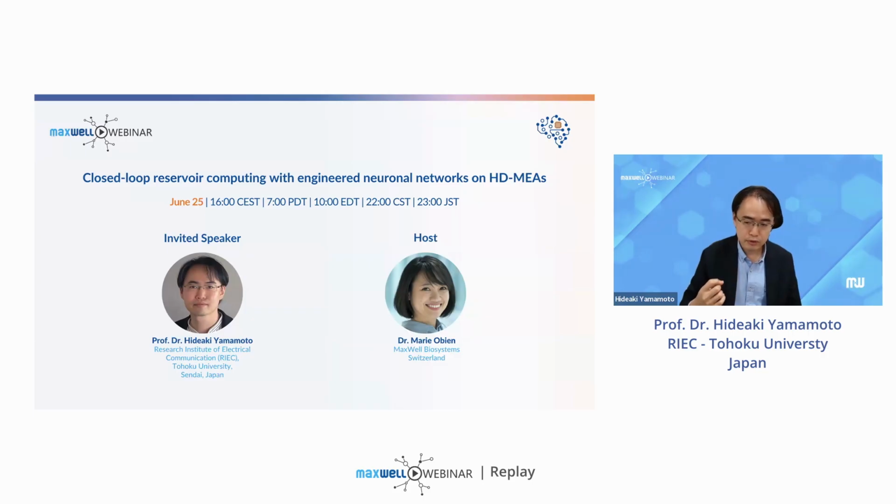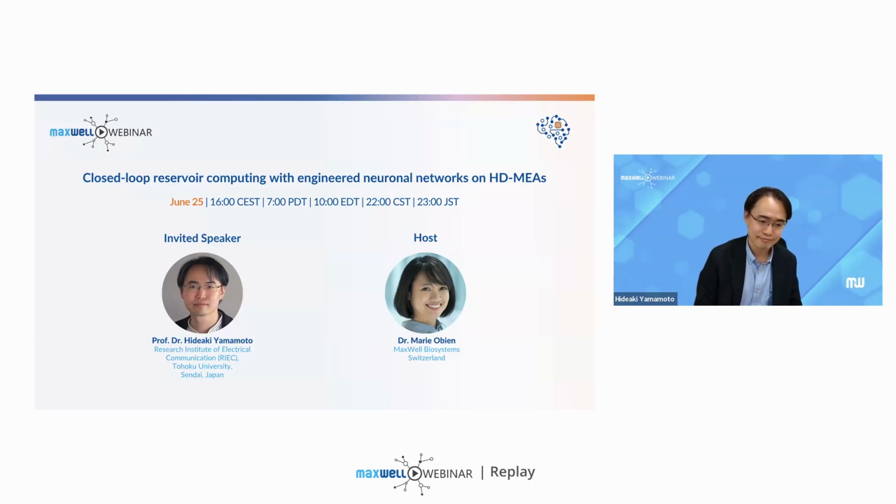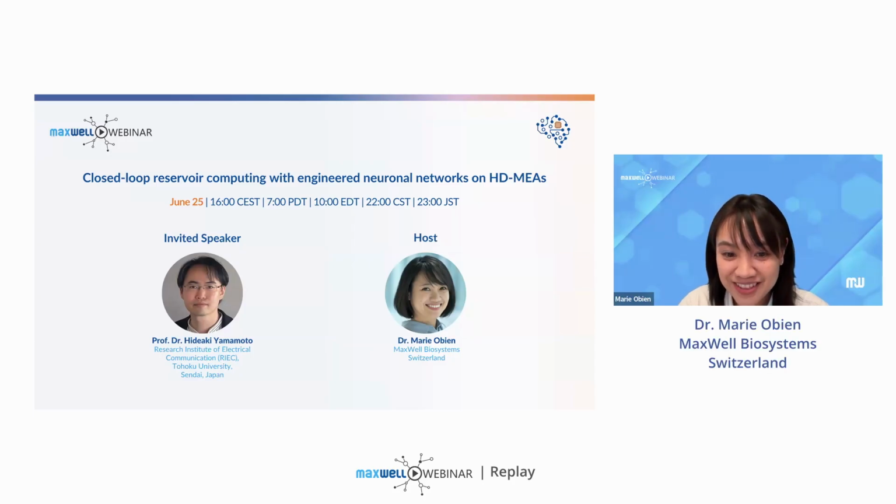Simultaneously, we could stimulate up to 32 electrodes at the same time, but just for safety we restricted it to 30 electrodes. And so the stimulation is delivered to 30 randomly selected electrodes. Thank you so much. I hope that answers your question, Jonathan.